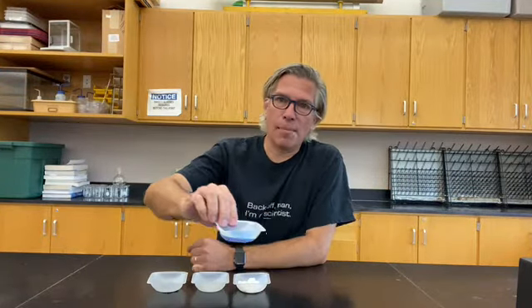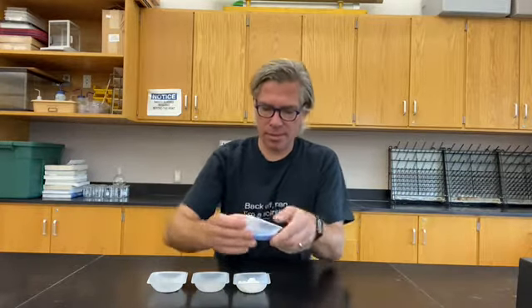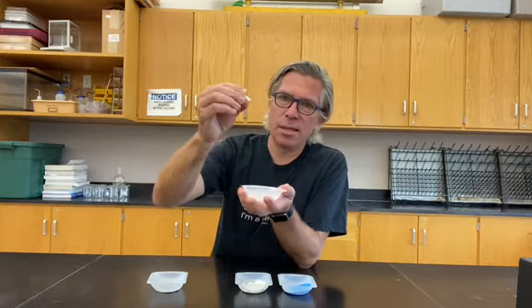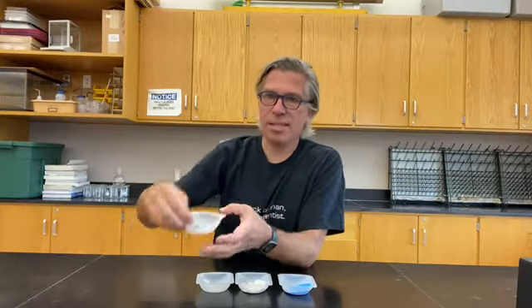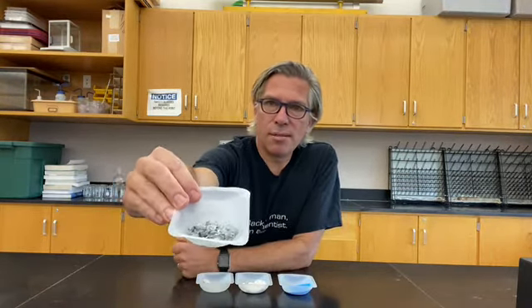We have copper sulfate, which is a blue crystalline solid. We have dextrose, which is a white solid. Can't really see any crystals, but I do see some fluffiness there. We have paraffin, which is a waxy substance. I've got little chunks of it right here, kind of soft and pliable. And I have some zinc, which has a silvery, shiny, metallic luster because it, of course, is a metal.